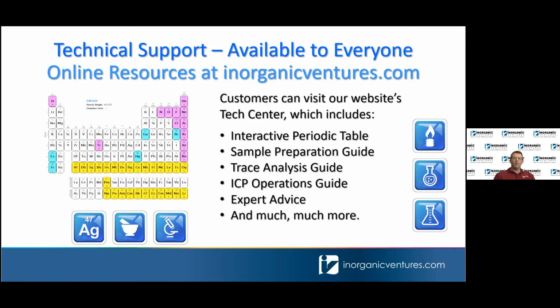If my highest concentration in a multi-element standard is 1 ppm for optical emission, and we're not using mercury or bismuth, and you're using internal standards, scandium and gallium, are there any washout concerns for elements at that level? And I'll repeat this for the panelists. Highest concentrations in an OES multi-element standard are 1 ppm. Internal standards are scandium and gallium. Are there any washout concerns at that 1 ppm level?